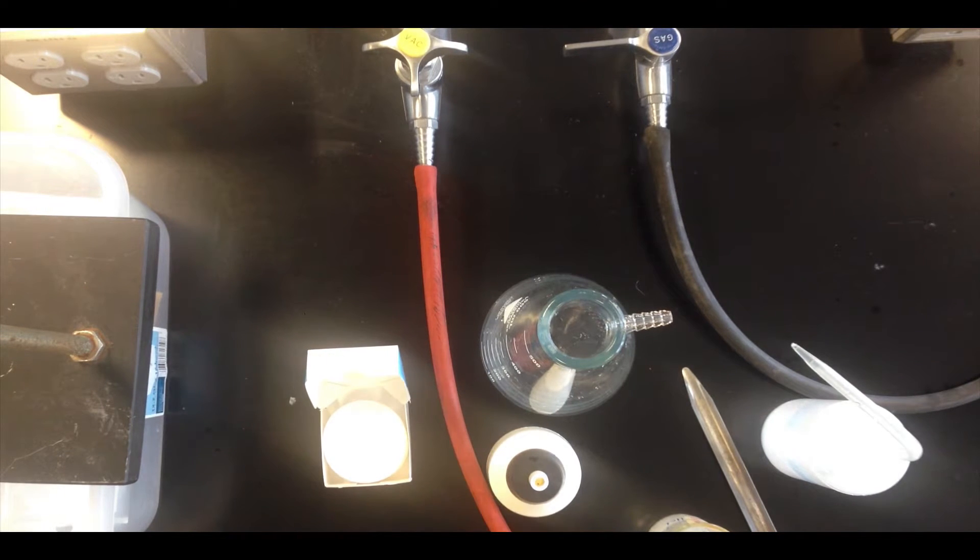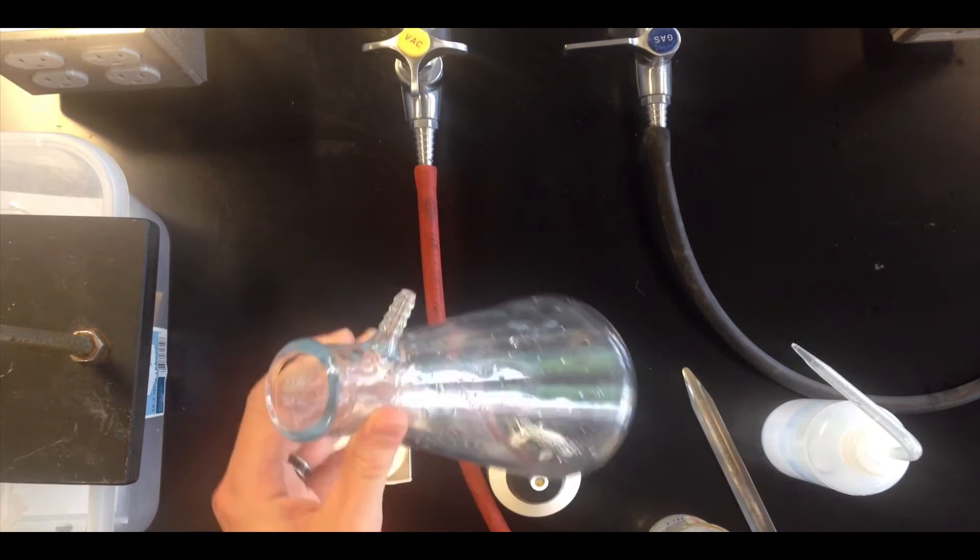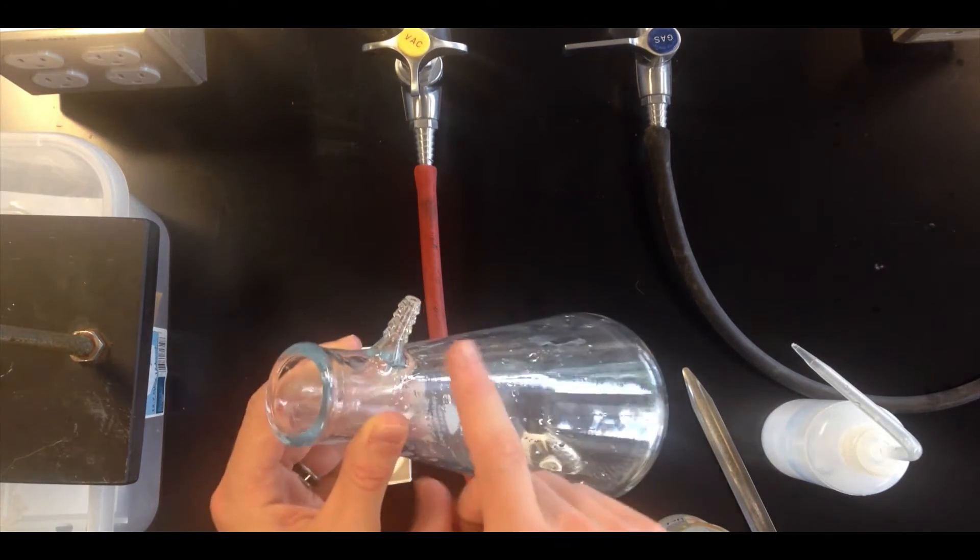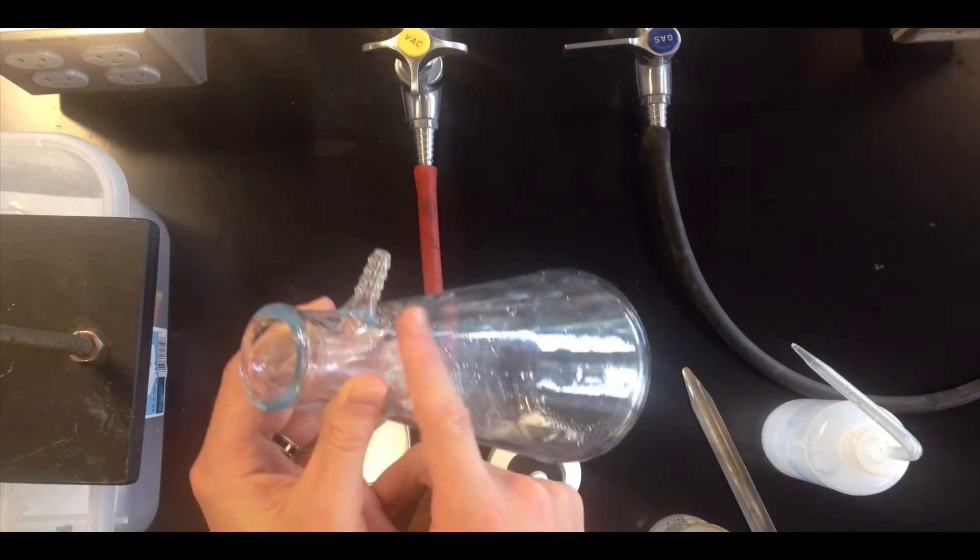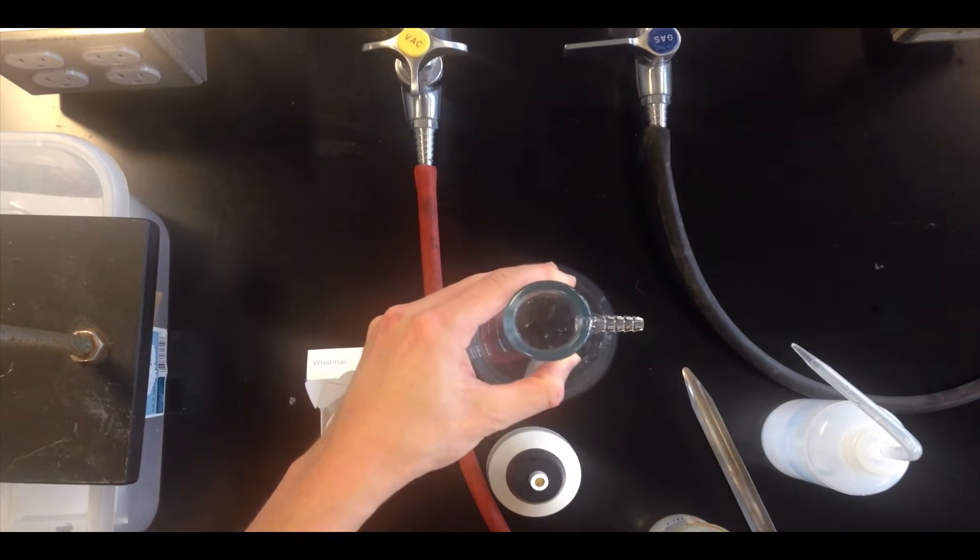there are at least three things that we absolutely need. The first is a flask that looks like an Erlenmeyer flask but has a little sidebar at the top, this barbed tube up near the top of the flask. This is what's called a filter flask, and that barb, as we'll see in a second, is essential for obtaining the vacuum effect that's characteristic of vacuum filtration.